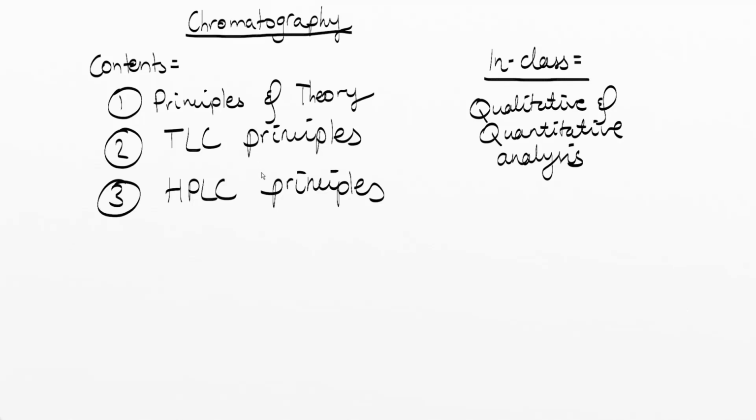Welcome to chromatography. In this video, we'll look at the principles and the theory of chromatography, and the principles behind thin layer chromatography and high performance liquid chromatography, also known as high pressure liquid chromatography. In class, we'll look at the qualitative and quantitative analysis using these types of chromatographic techniques.